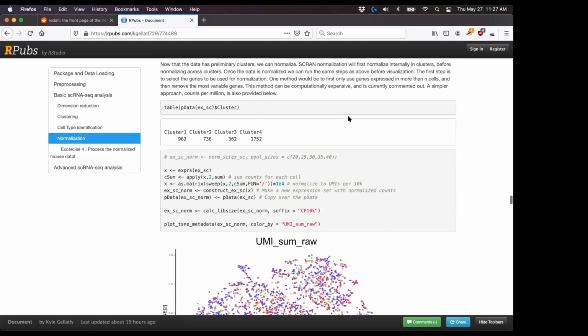So now this is the exercise we're going to skip for now, and I'll show you why in a second. You're welcome to do this later. I saw someone had an error about data being loaded or not. If you use this HTML document and run from the top to the bottom, everything will function perfectly fine, as long as you don't skip any of the lines. So later on, feel free to run this.